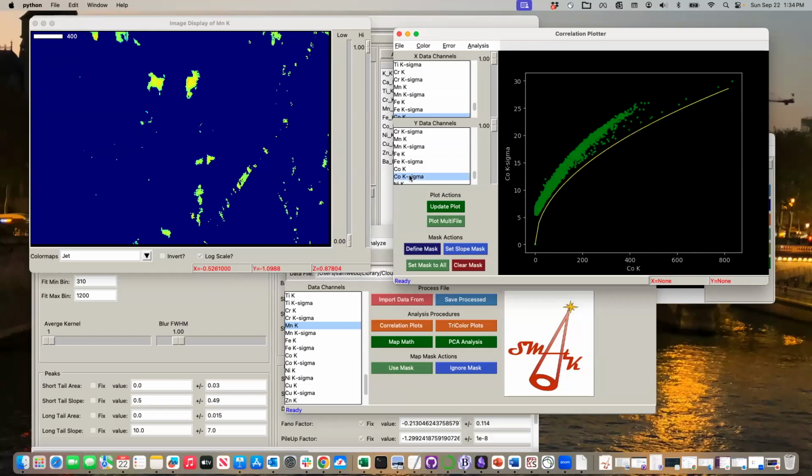It's all present there, but it's present at an area where my error bars are higher than they probably should be a little bit. So just be aware of the error bars on them. It's still within the error, 200 counts plus or minus 15 or so. But the error is higher than the Poisson statistics should be. So there's extra error, probably due to the overlap of iron and cobalt in the fitting there.